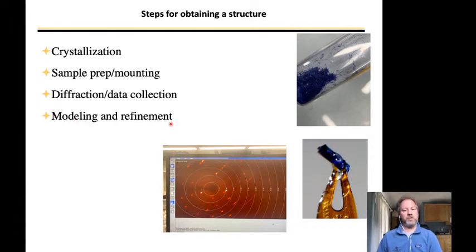Modeling and refinement is all done in the computer, and for a reasonable data set, actually solving and refining the structure is pretty straightforward. The computers are really quite good at doing this now, but there are some tricks and some things that you need to learn, and it's really a practical skill, not something I can really teach in a lecture.